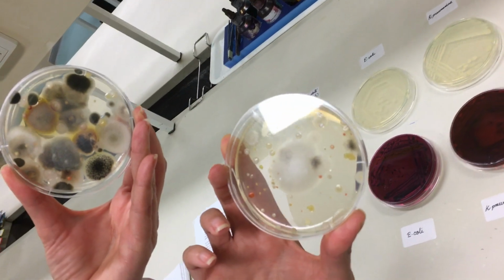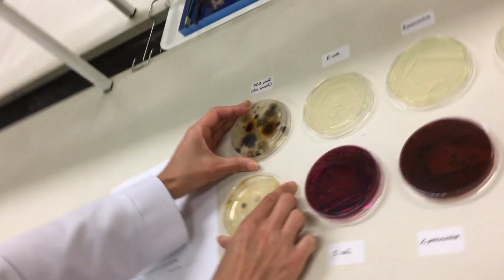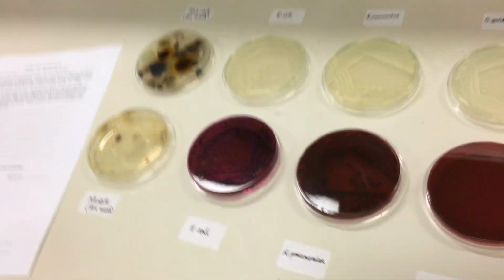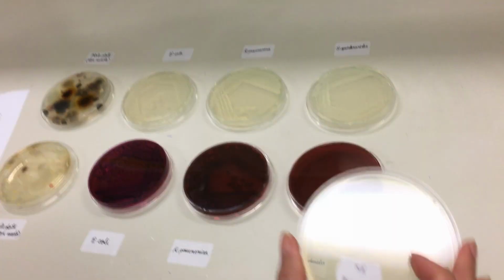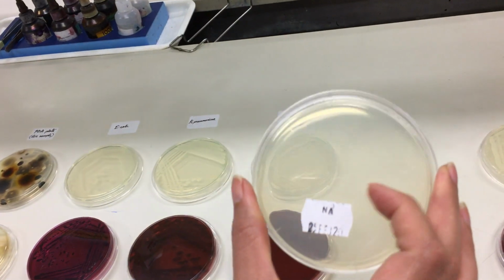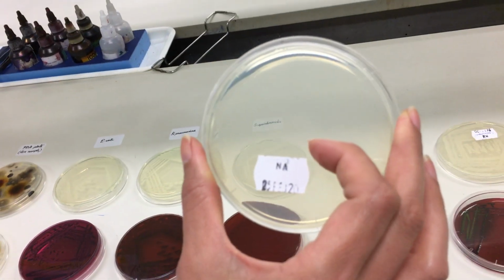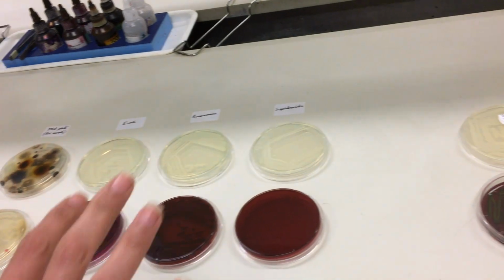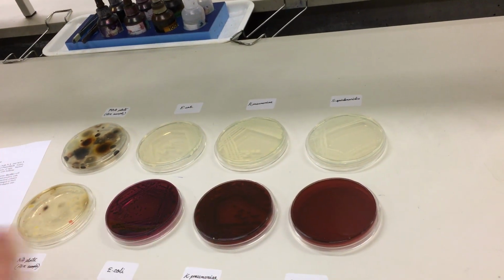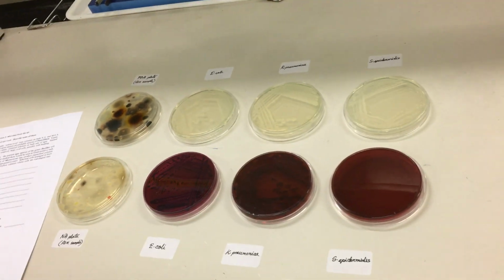You can see how many yeast, bacteria and fungi grow on these plates, and I will share the picture of these plates with you. So this is again an example of a not good streaking sample. So perhaps the loop was hot and that's why there is no growth on it. We will share the picture of this expected result with you on Canvas.